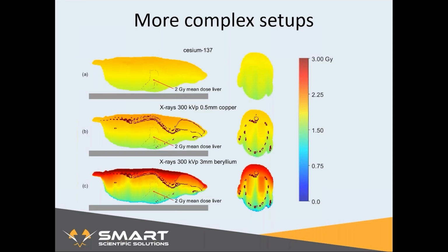It has a gradient, you see a bit more dose to the bone, but you could probably still approximate this with a point dose. But once you go to the X-rays, because of the high amount of low energy photons always present in the spectrum, you get an extremely high bone dose and also a shadow cast by the bone in lower regions. And it becomes almost impossible to calculate how this distribution would be by hand.